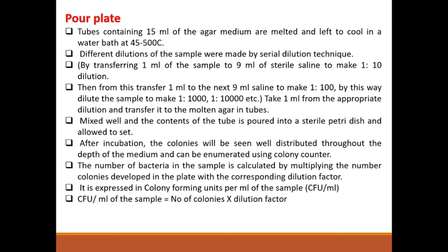After incubation, the colonies will be seen well distributed throughout the depth of the medium and can be enumerated with the naked eye or by using a colony counter. In our lab, we have a digital colony counter. By using that we can count, or simply by observing the plate we can count, using a marker pen.